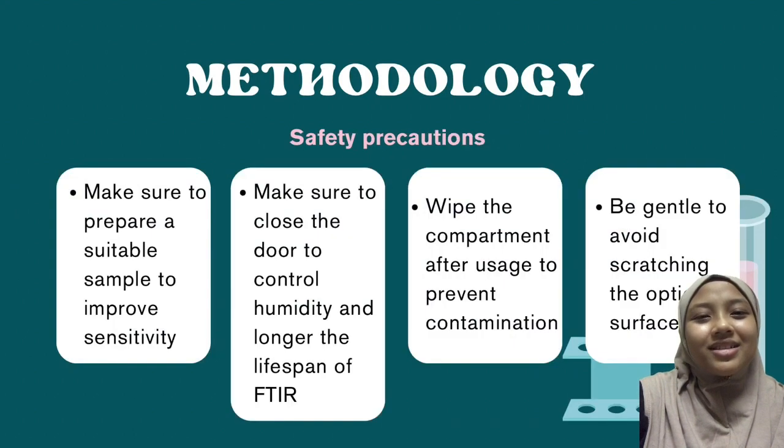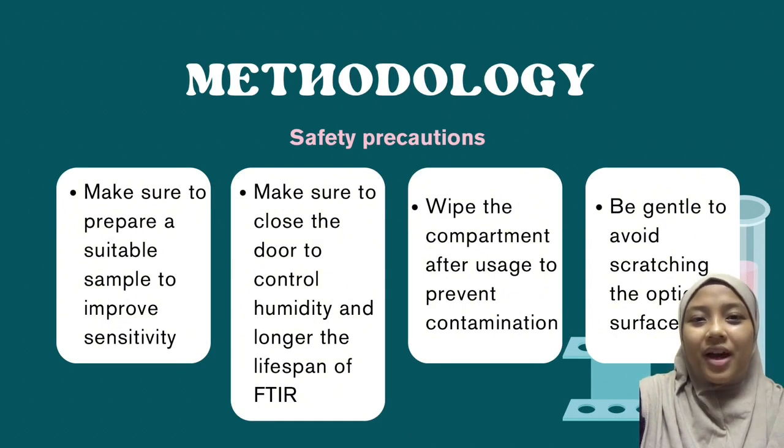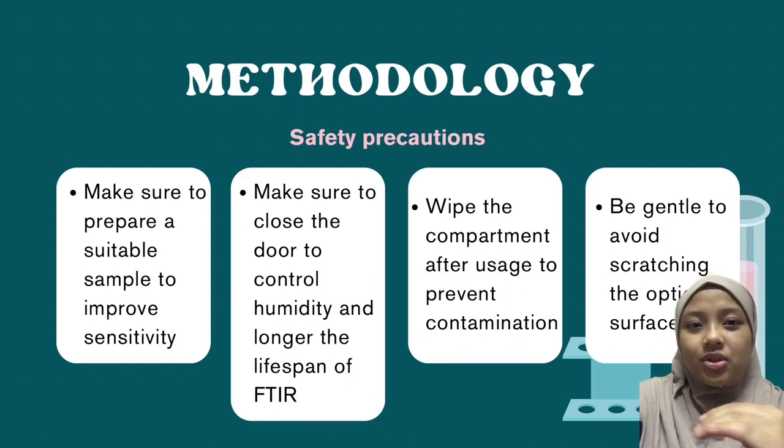And next, which is the last part of methodology, is safety precaution. Make sure to close the door of the FTIR to control humidity and lengthen the lifespan of the FTIR. Wipe the compartment after usage to prevent contamination of another sample. Like I've told you, it will affect another sample's spectrums. And lastly, be gentle when wiping to avoid scratching the optical surface, because if it scratches, it will affect the accuracy.